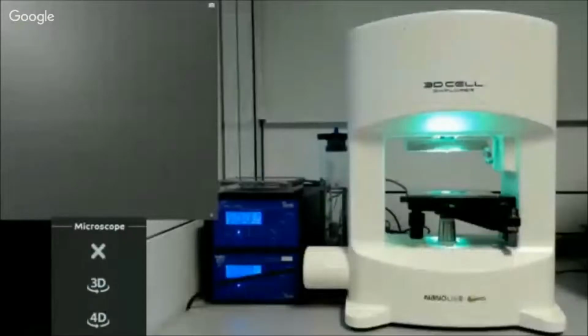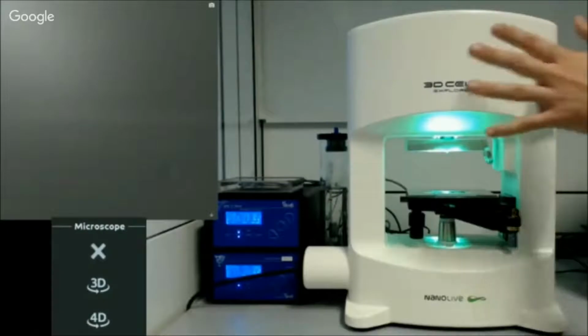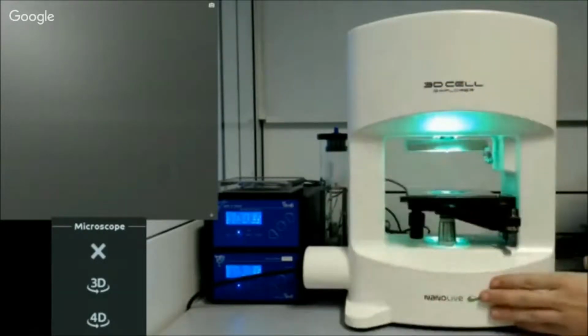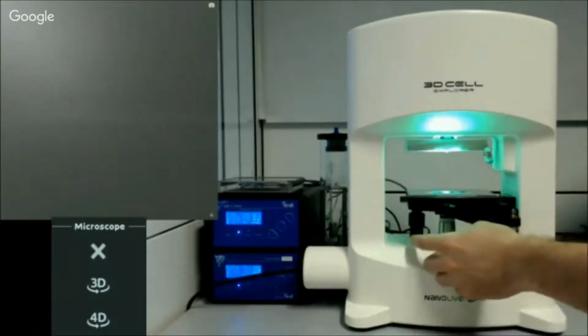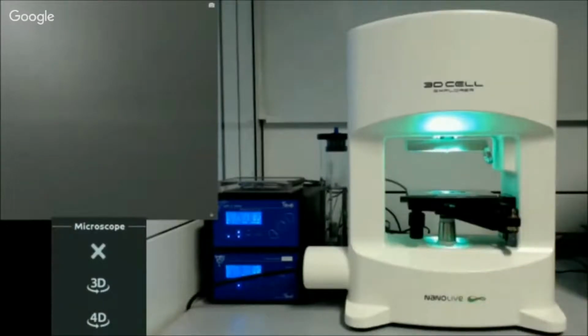So here we are. This is our microscope. You can see how small it is compared to my hand. You have here the knob for the Z, X, and Y. Very simple. The screen has been cut so that you can see here a white light image that we will use for the focusing. And those are the three buttons that we will push to stop the white light image, to collect either a 3D reconstruction or to launch a time-lapse. Today we will not launch a time-lapse, we will just take a single 3D reconstruction.